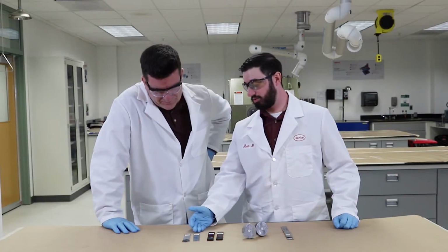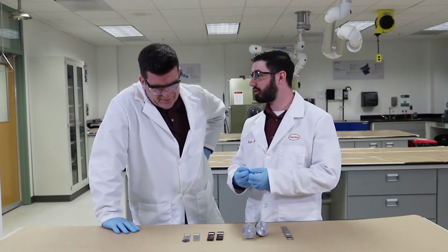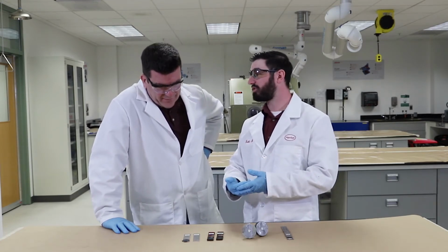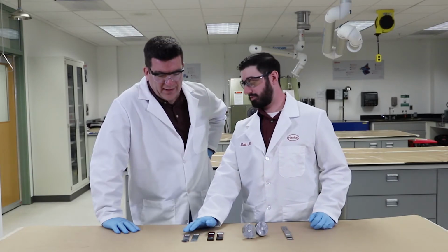Now this could be due to something on the surface. For example, if you put a sample in a plastic bag, well, there's a release agent in the bag that may be rubbed off on the surface that needs to be cleaned before you can bond it. So something like this, maybe the surface wasn't cleaned. Okay. So that makes sense.